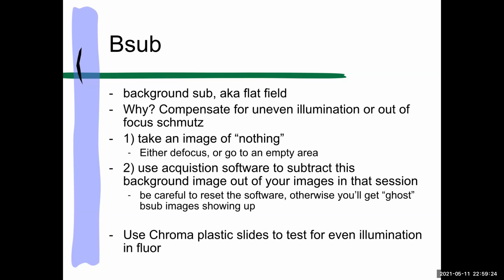And you're not allowed to Photoshop out Schmutz ever. You are allowed to crop your image so you don't see it if the Schmutz has been kind enough to land in an area that is not that exciting. Okay, so also dirt in various parts of the microscope. Anywhere in the microscope can show up as out of focus sort of blobby stuff if there's a giant chunk of dirt somewhere. And giant, of course, in a microscope is not that big, right? So a bunch of dust maybe somewhere.